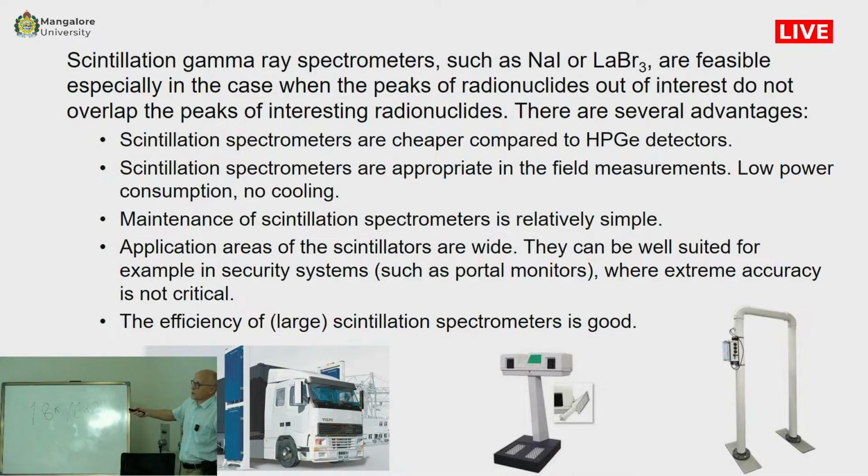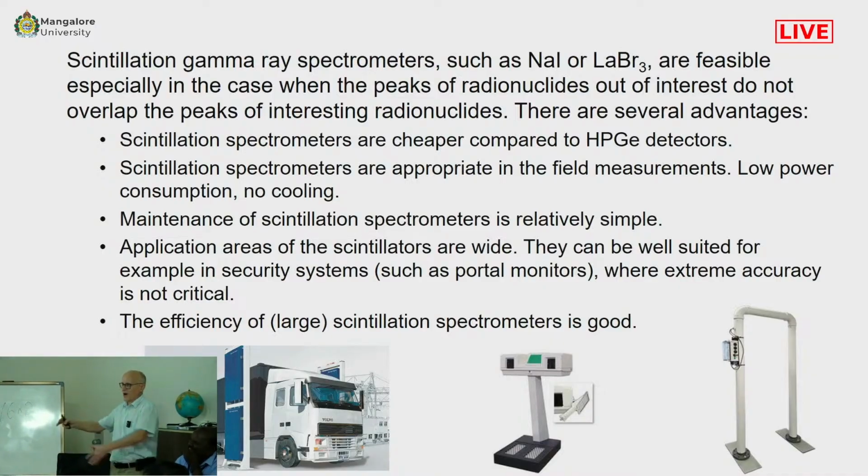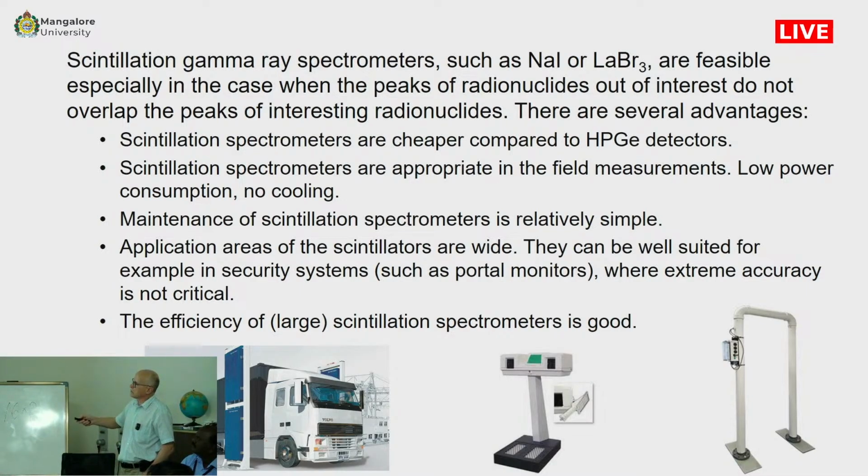They are appropriate in field measurements. You cannot carry heavy lead shields out of the laboratory. They need low power, no cooling. Maintenance is relatively simple.